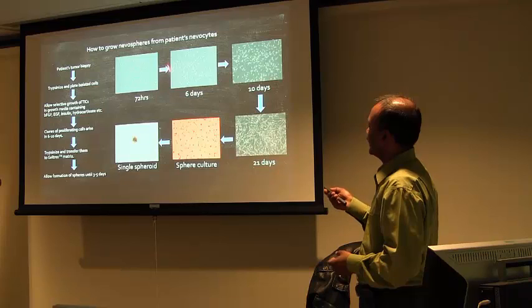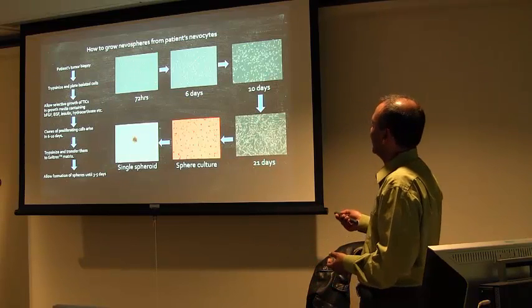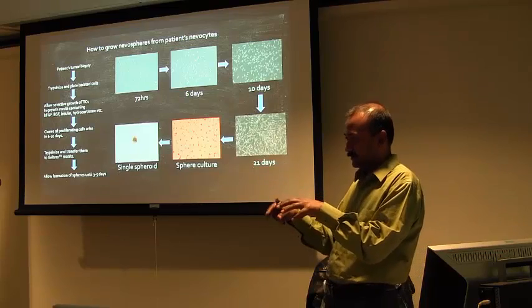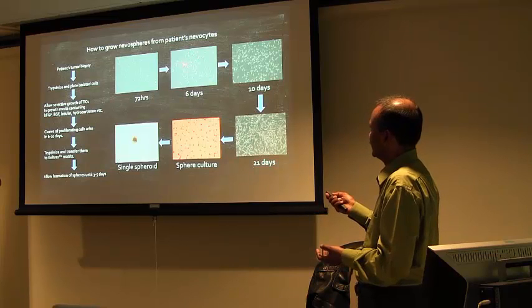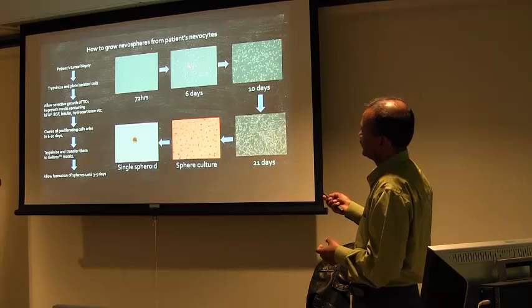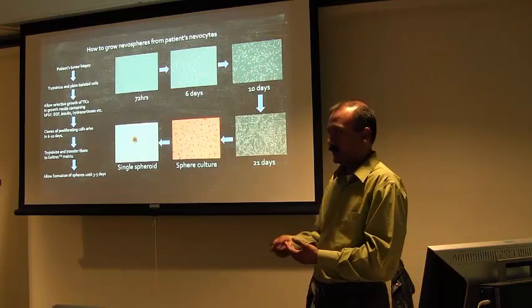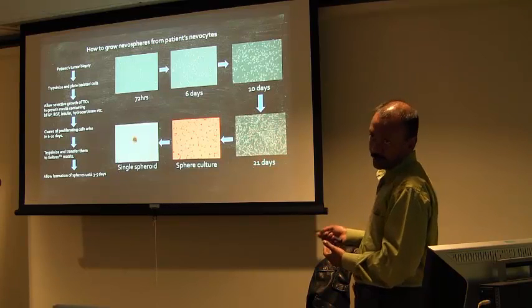So it takes a while for these cells to really go into division. That's what I was mentioning. Around 6 days, you can see clones of cells coming out on the plate, in several areas where you see bursts of proliferative activity, and those cells look like this. They have short dendritic expansions and are not so brown at this point, but the more they grow, at around 10 days, they start dividing, and they become confluent in 21 days.